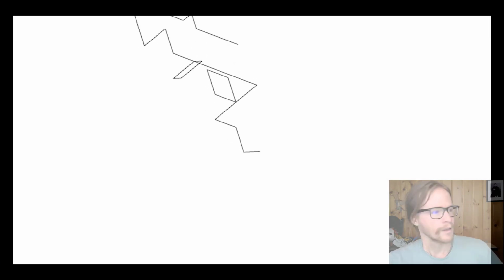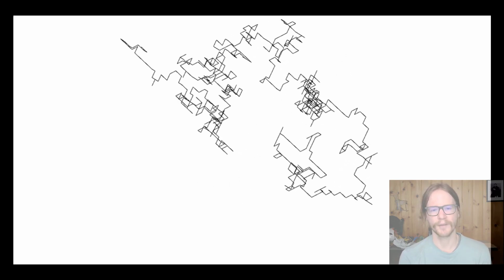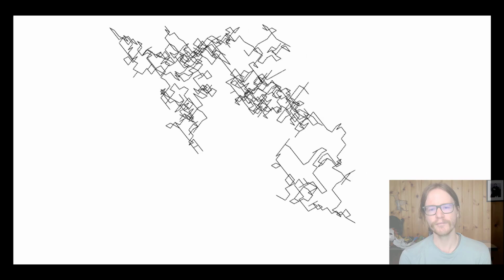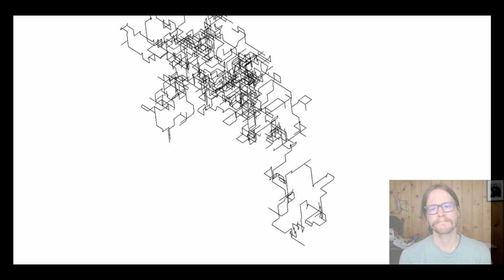And so what I have here is a MATLAB simulation that I just grabbed off YouTube of the 3-dimensional random walk, which you could imagine as being just a particle in space, or a particle inside of a column where it has this randomized binomial decision choice to move in x, y, and z dimensions at any given moment in time. So it looks like this. You can just see the particle moving. This is 2 times playback speed, so this is moving pretty quickly. But this is a binomial distribution in 3 dimensions.